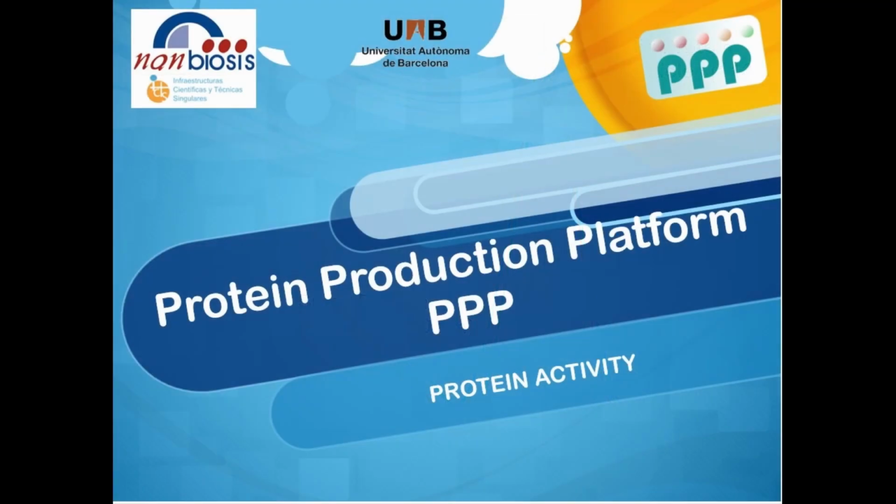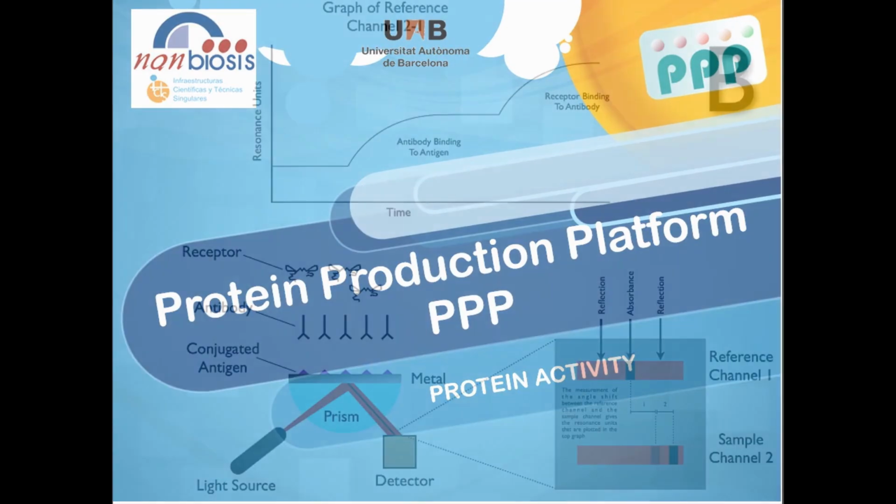Protein activity. In some cases, it's necessary to obtain the protein in an active state. In this case, specific activity assays must be performed over the purified proteins. The method must be specifically designed to the type of activity of the protein to be analyzed.